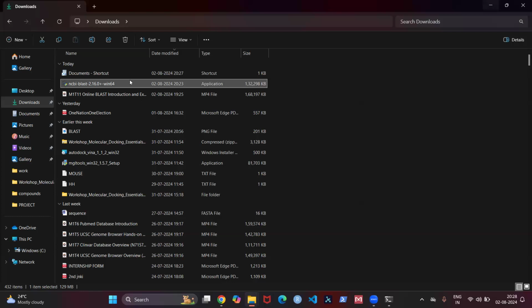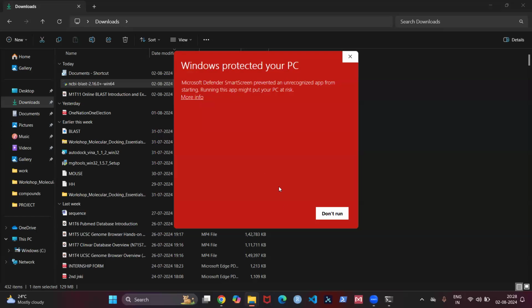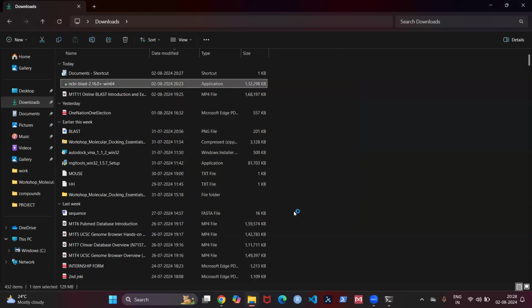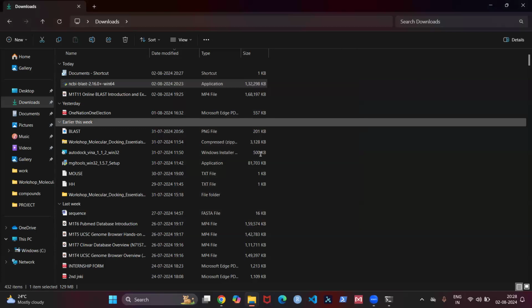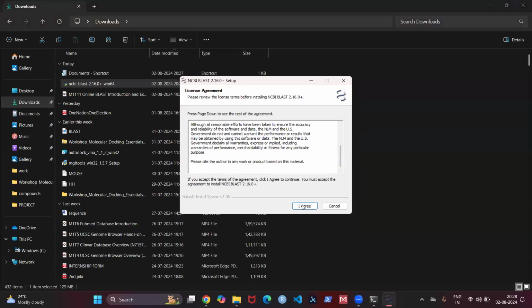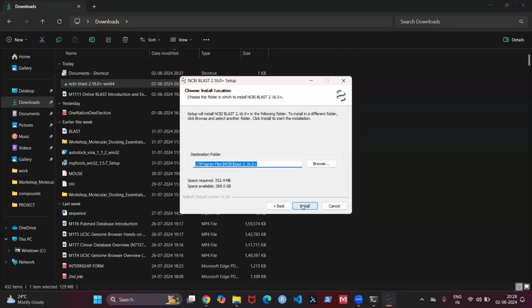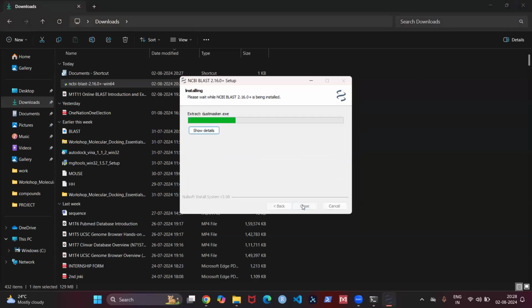You can click on more info and just install it. It will not actually harm your system. Run anyway. I agree. Next, install. Completed, so you can close it.